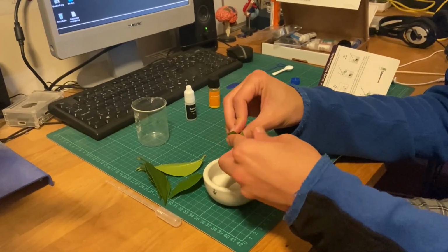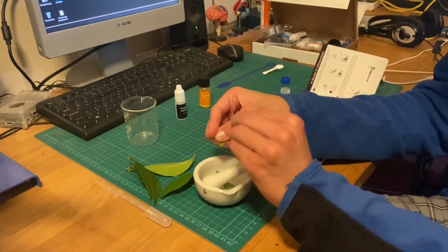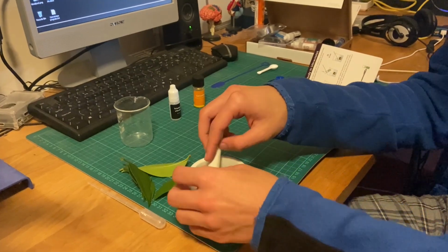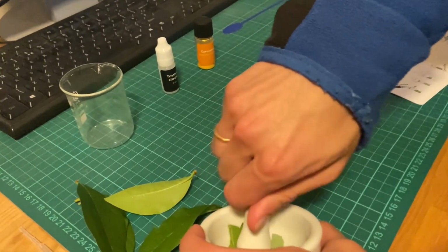In this next experiment, we must first crush some leaves using a pestle and mortar to break down cell membranes and cell walls to release chlorophyll.